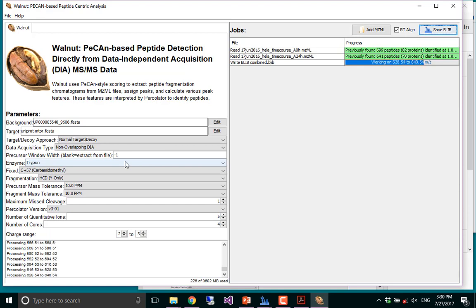Does that make sense? You really need some kind of an automated tool to be able to pick transitions and be, honestly, independent and consistent every time. Okay.